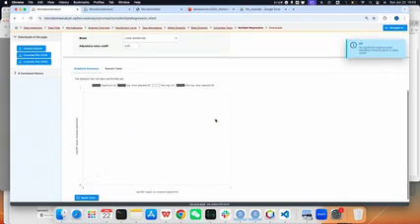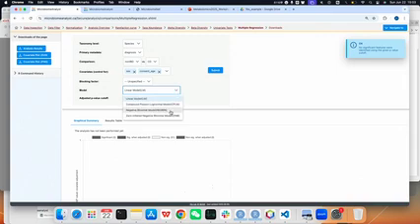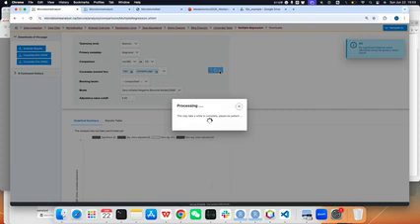So we can see here there are no significant features because we use a linear model. A linear model assumes that the data has a normal distribution, but it's usually not the case for microbiome data. So we may find other models more specific to the microbiome data. We can see if there are significant features.